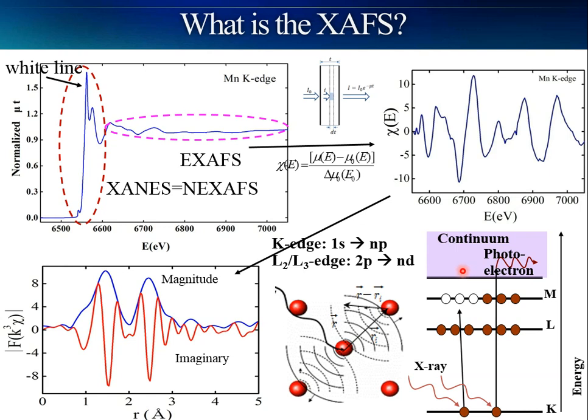As the energy increases, the electron becomes a photoelectron in the material that can move around the neighborhood, as shown in this picture. Now we can consider the electron particles as electron waves in quantum physics.